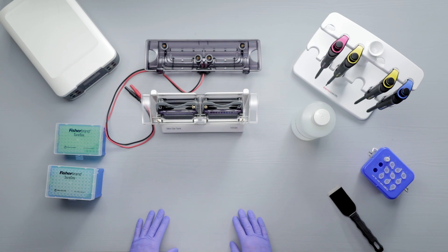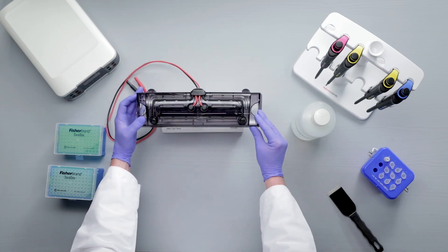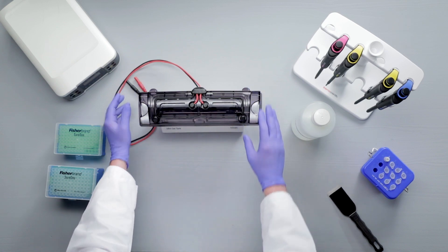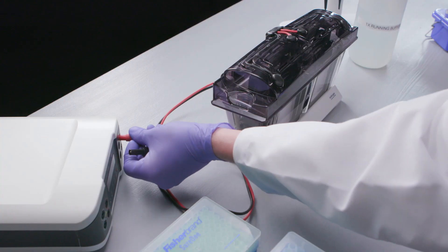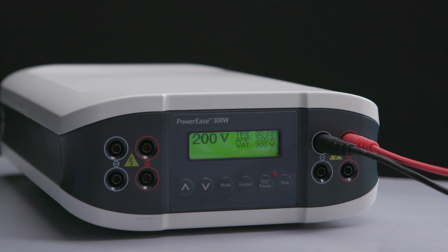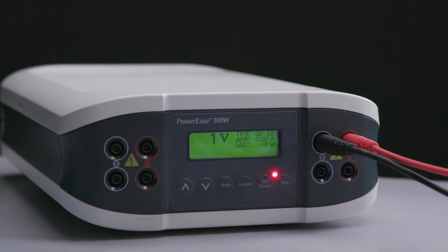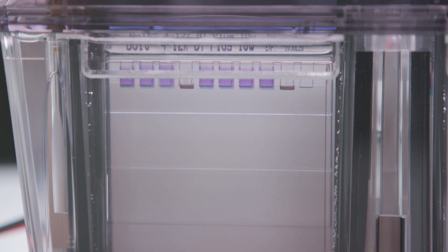Place the lid on top of the tank and align the electrode receptacles in the lid with the corresponding electrodes in the tank. Push the lid down firmly. Connect the electrode cords to the power supply. Set the power supply to the appropriate run voltage and time. Bolt gels can be run at 200 volts and electrophoresis can be completed in as little as 20 minutes. Now start the run. Bubbles appearing around the cathode indicate that the current is flowing.